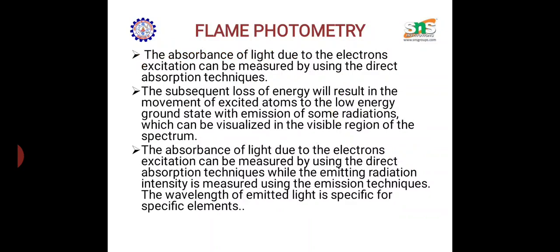Based on the wavelength emitted, the specific element can be identified. Sodium emits at a certain wavelength in the yellow region. Like that, each and every element has its own characteristic emission.